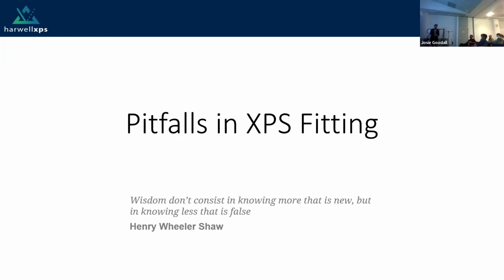Simon actually gave a fantastic example at the beginning of this talk of identifying a problem, some erroneous fitting in some published XPS data, and then doing more experiments and actually verifying or contradicting their interpretation, finding the real interpretation. In that case, it was fitting gold structure. Unfortunately, that situation is not unique. It's nowhere near unique. In fact, bad fitting of XPS data is rather endemic in the literature.